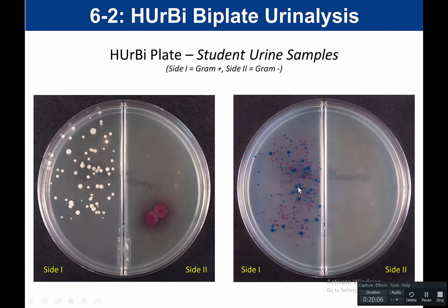If I want you to calculate the original cell density, I will give you colony numbers. Or if I just want you to say positive, negative, or borderline, you should be able to just look and say, okay, that's definitely between 10 and 100, so that has to be borderline. Or that's definitely more than 100, that has to be positive, etc.